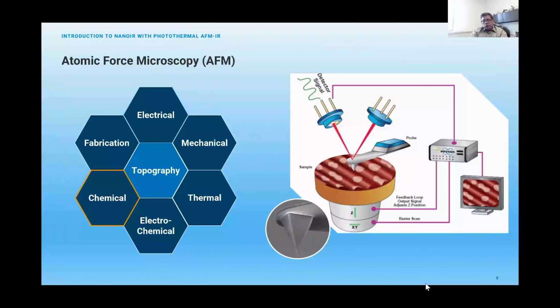And then you can see the atomic force microscope world. You can see these different techniques: thermo, electrochemical. You can also fabricate with AFMs, like nanopatterning techniques. You can do mechanical, electrical. So AFM is widening into different technology areas, and a single tool can do multiple things.